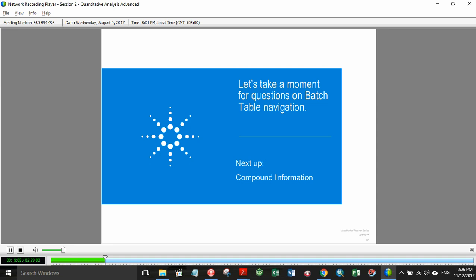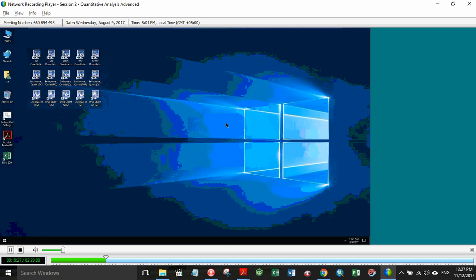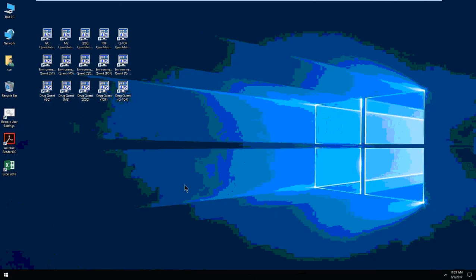Okay, having gone over some of this, let's take a few minutes here for some questions or something along those lines. And Howard, do you have a demo for this for us right now? Yep, sure do. Got a few things we can look at here. So let me just get that pulled up for everyone. And again, since you'll be viewing a desktop, I'll remind you that you can maximize your view there in the WebEx to make things a little bit bigger, a little bit easier to see.